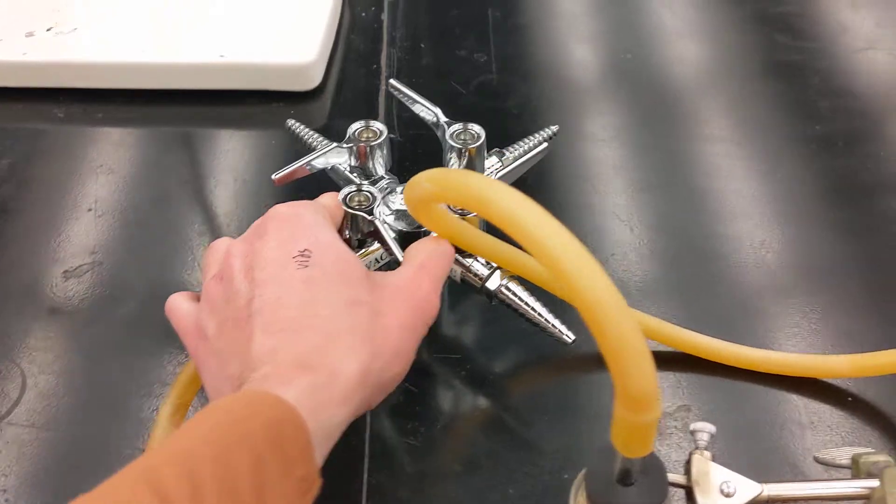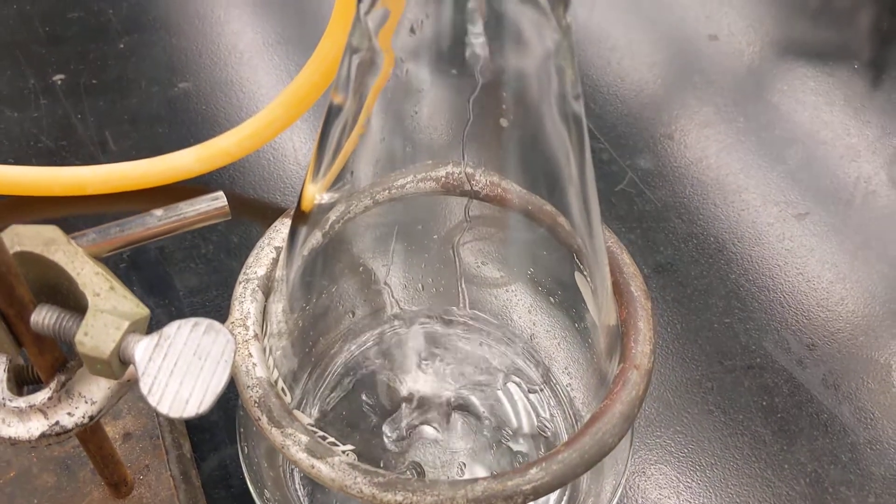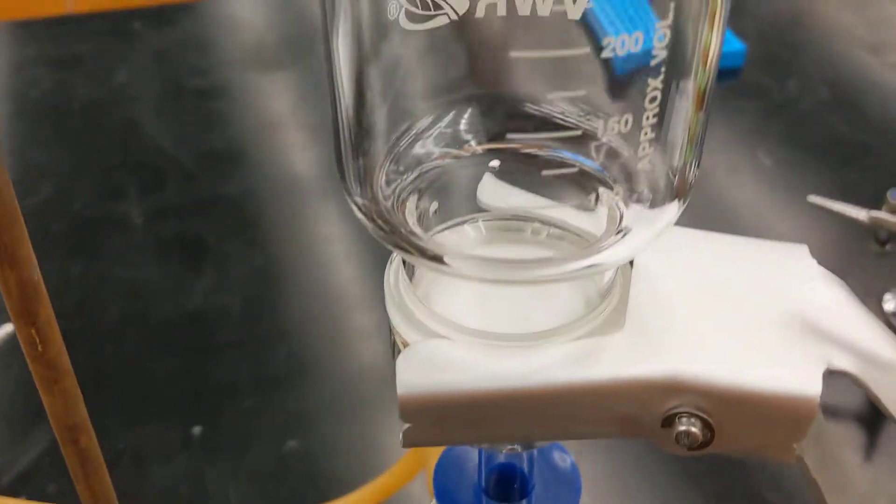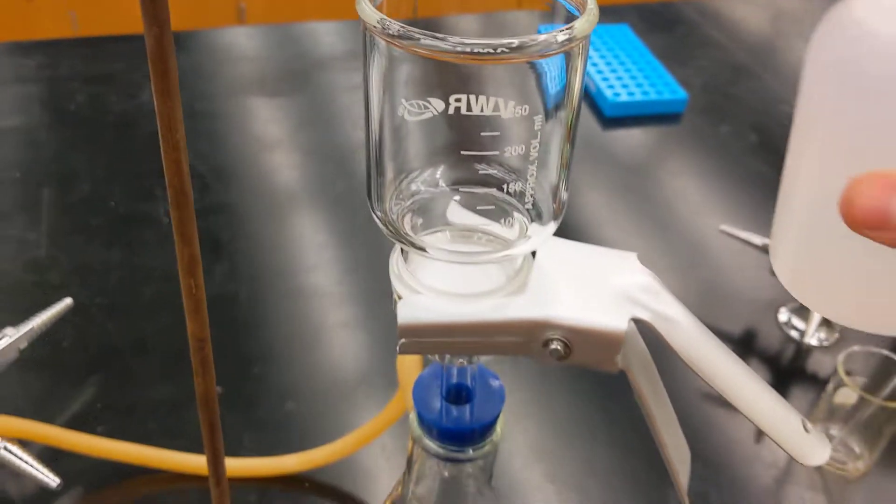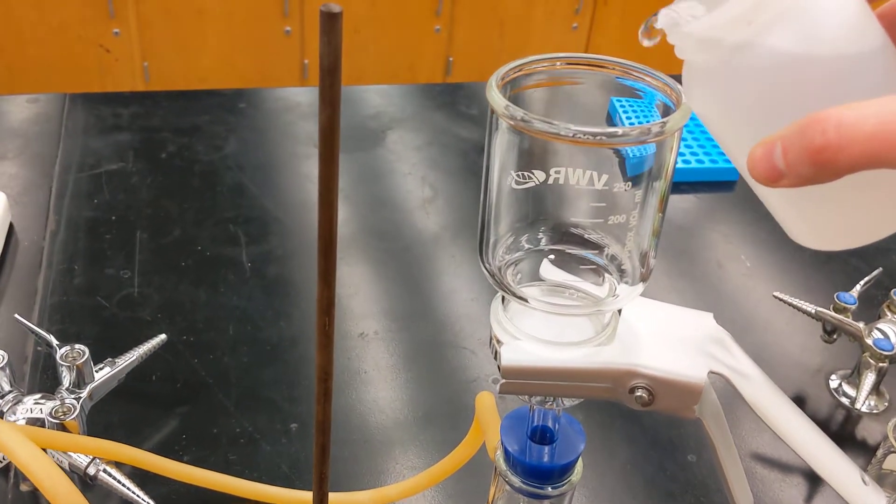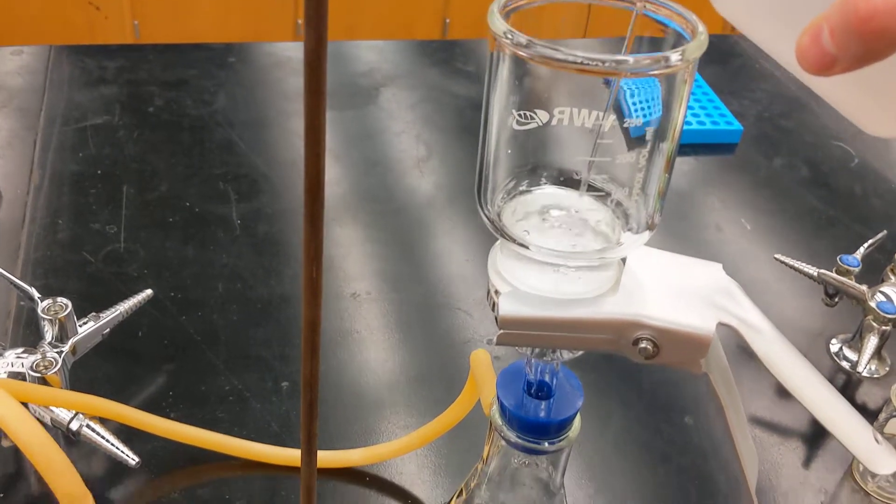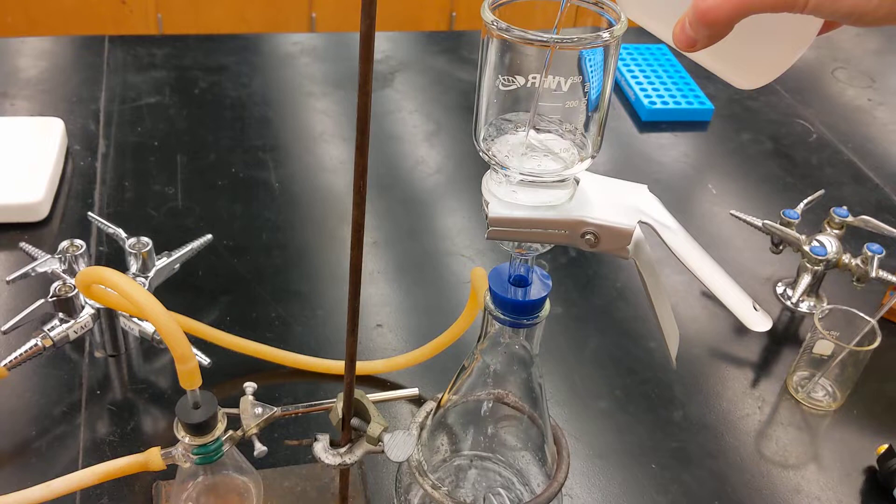Then I'm going to go ahead and turn on the vacuum line, open that and see the fluid drain down. Okay, so I've got a nice wet filter. I'm going to leave the vacuum open and I'm going to slowly pour this in. I want to keep that filter wet the whole time during the duration of the filtering process.